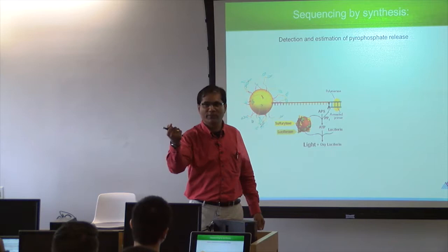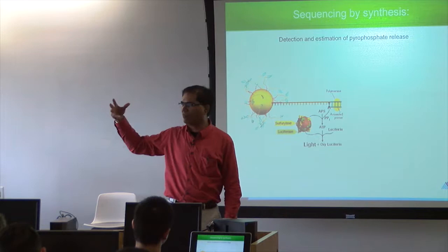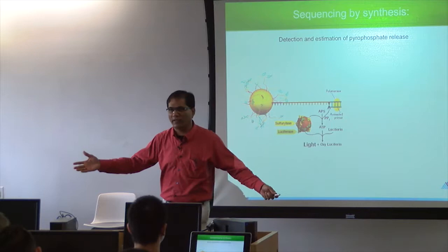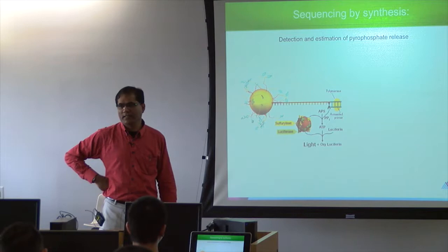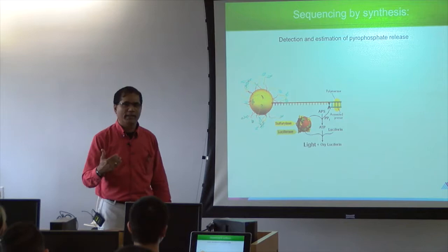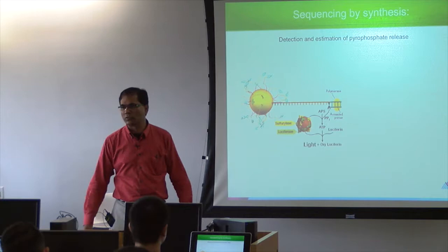Homopolymers, if you have stretches of ATGCs, that becomes a problem. After 6, 7, 8, they are developing more technology, more algorithms. Now computers and cameras have come into being and detect much more accurately in these stretches. But if there are no stretches, you can do that accurately. So that is a limitation of this technology. Okay? So even when you're just thinking about it, you can understand the technology limitations. So homopolymer stretches of ATGCs, you can do under 5, 6, 7. Earlier it was 4, they said after that 5, you can do 6, 7. They went up to a certain amount. After that, it is tough to do. But the big amount of the genome, the functional genome, doesn't have all these stretches, so we can use that for the sequencing. Okay, cool, clear.